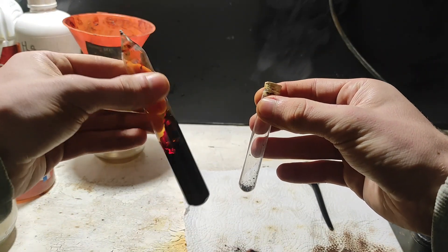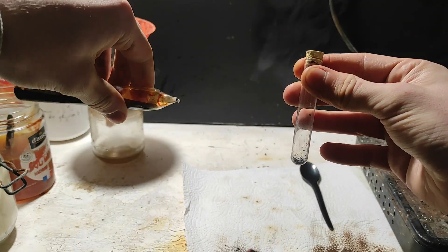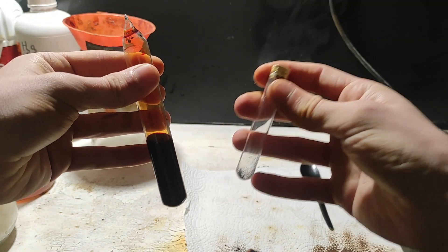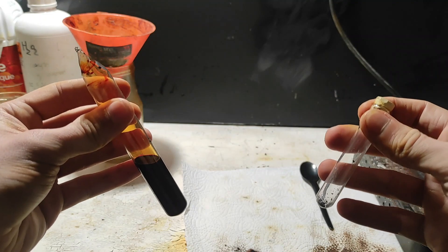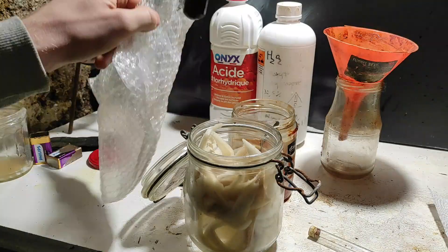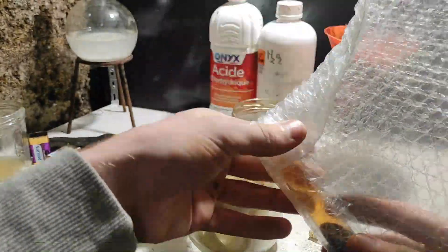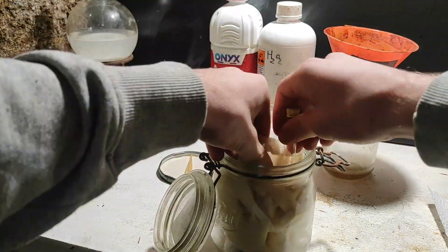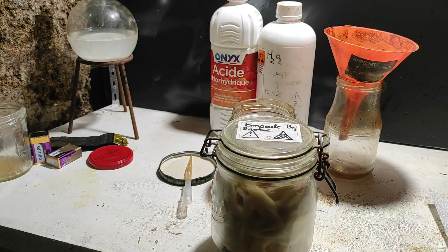I love the halogens, and here's my sample of bromine sealed in an ampoule. Maybe one day I'll also make liquid chlorine and put it in an ampoule, but right now I don't have access to dry ice, so this project will have to wait. And you might ask, what about fluorine? Well, I don't want to die soon, so I won't make fluorine. Anyway, I'll store my halogens in this jar with protection in case anything goes wrong.